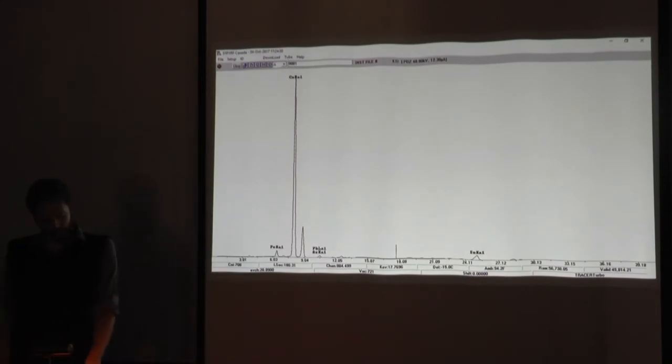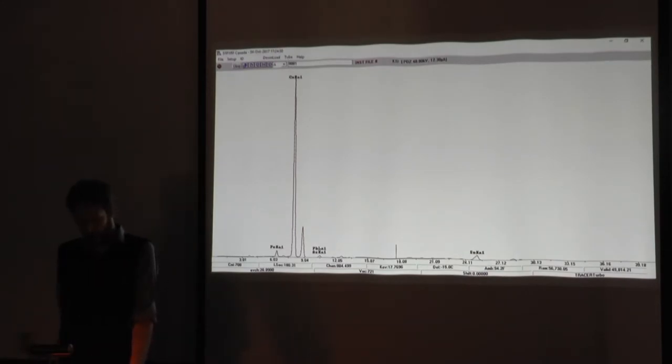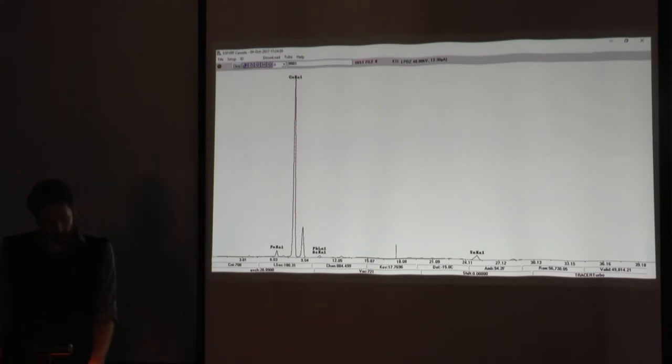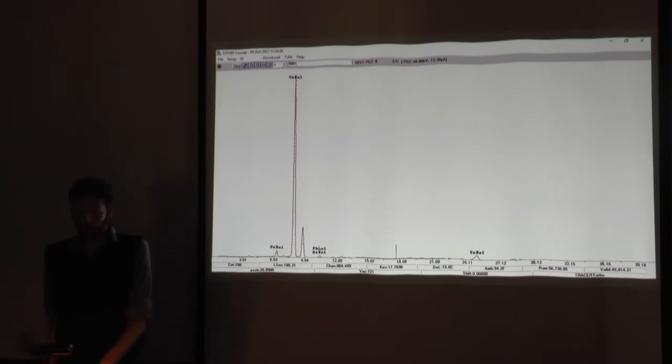This spectrum was actually our first shot on the helmet. We shot a total of 30 points for a length of 3 minutes at each point. There are 11 points on each side of the helmet, 3 on the rivets holding the two halves together, 3 on the patch, and 2 on the patch's rivets. The resulting spectra were studied individually and as groups corresponding to their location on the helmet.